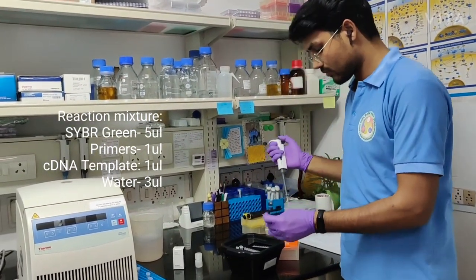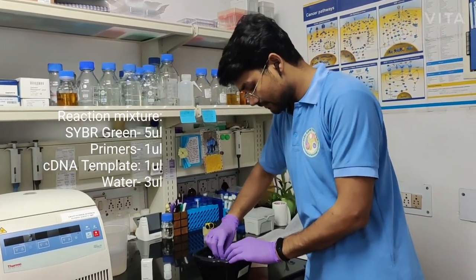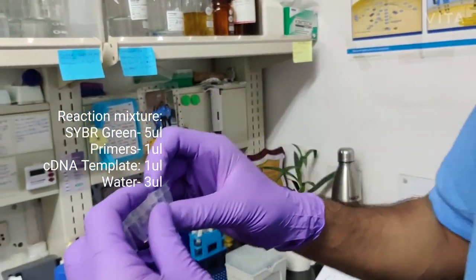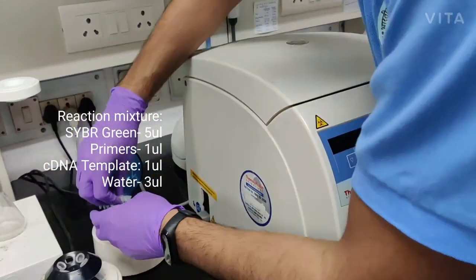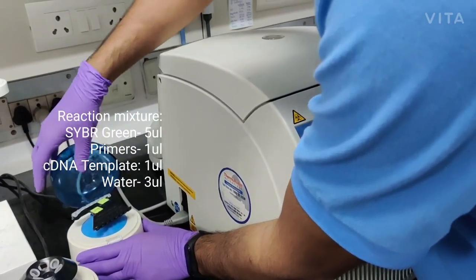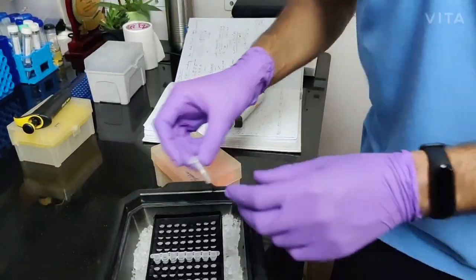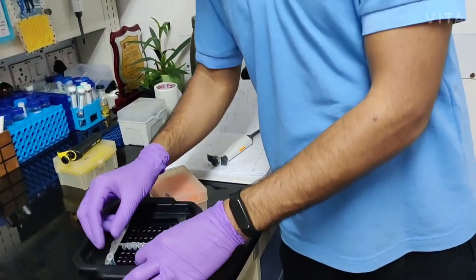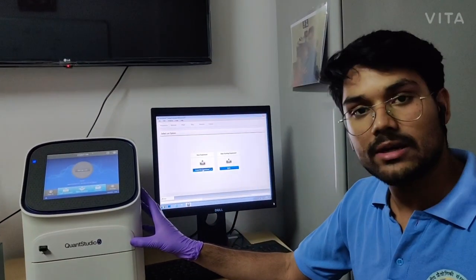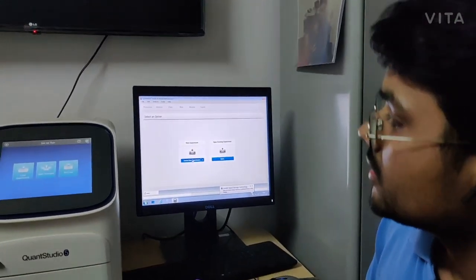Now the reaction is complete. Close the lid. Just spin it. Now the reaction is set up, we'll just put these tubes in the real-time machine. Now we just set up the real-time reaction. This is the QuantStudio real-time machine. And we will just set up the complete run.